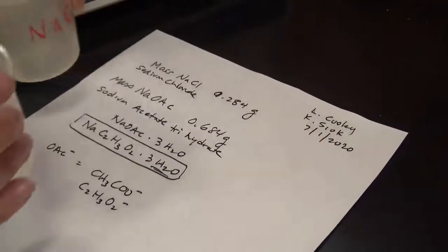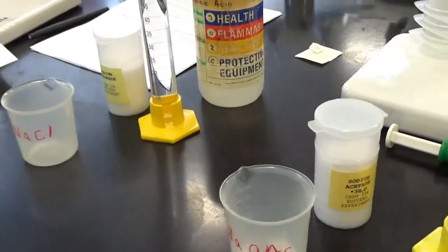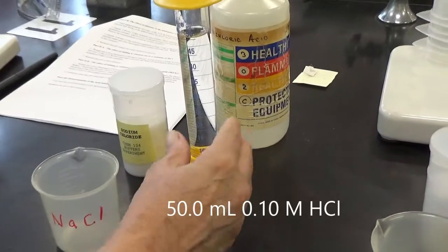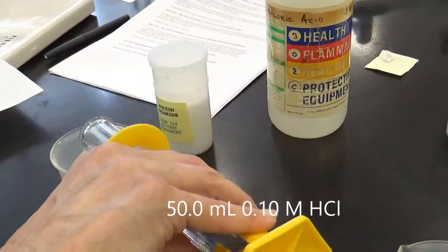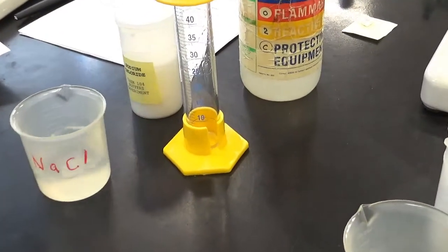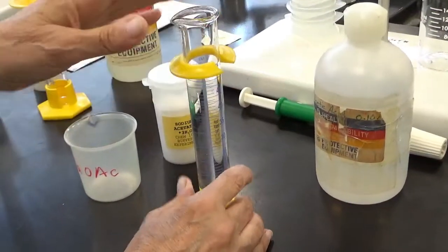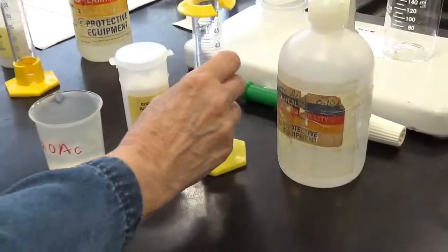I'm going to go back and put in the 50 milliliters. So here's the 50 milliliters of each acid, and we're going to use it to dilute first of all the sodium chloride and the HCl. I just used a graduated cylinder. So this is HCl in here. 50 milliliters. Pour it into the beaker with the NaCl. And then we want it to dissolve. Naturally, we'll check that out later. Let's do the next one. We're going to do the acetic acid and the sodium acetate. This was the 0.1 molar original solution, before it was diluted.